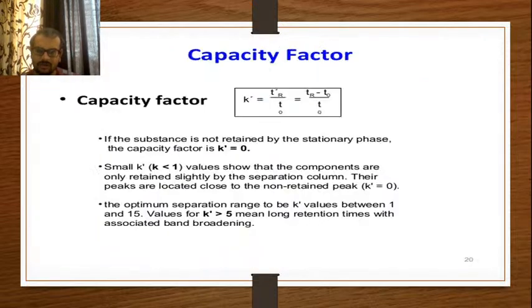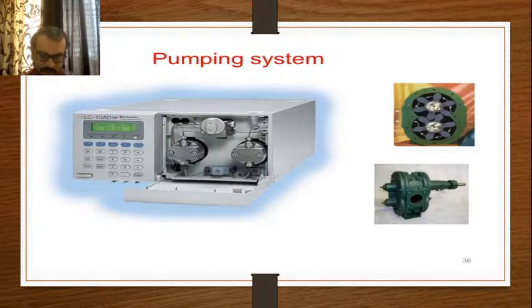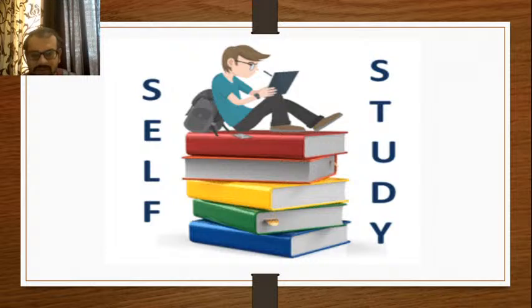Actually we will have to complete it now because we are dealing with the instrumentation. Degassing has been done. Now we will deal with the solvent reservoir system. In the Mumbai University syllabus, the pumping system is for self-study, but I will make sure the overall idea regarding the pumping system is covered, because it forms an integral and important part of your HPLC. That is the difference between HPLC and other chromatographic techniques. Because of its pumping system, the effective forceful introduction of the mobile phase through the stationary phase leads to efficient resolution along with the time factor. It is the highest possible resolution. That's why the study of the pumping system becomes important.